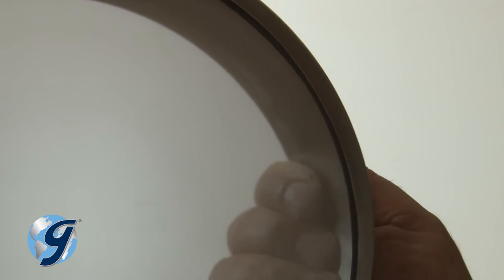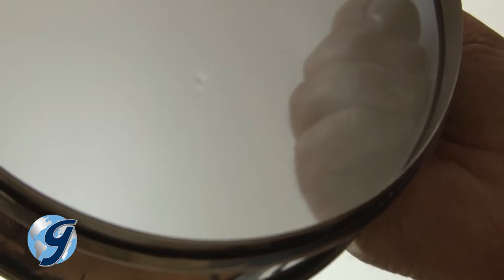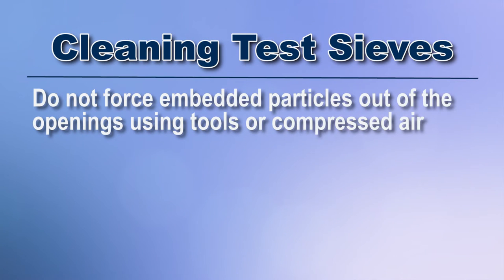Be sure to periodically examine finer mesh sieves against a backlight or white background for damaged openings or perimeter separations. Do not force embedded particles out of the openings using tools or compressed air.